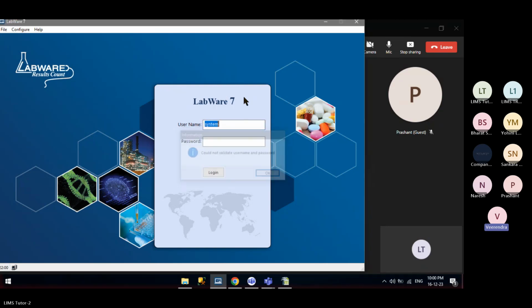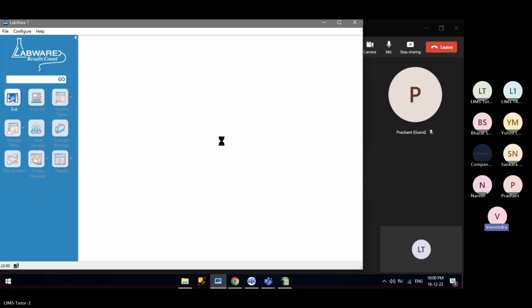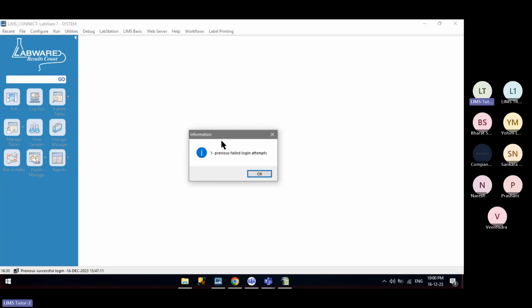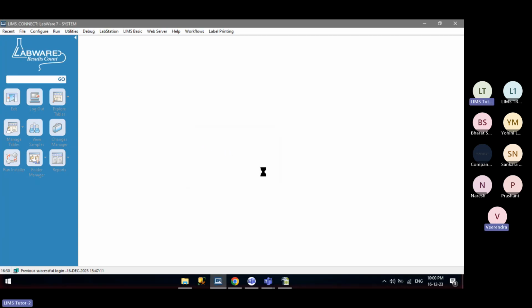I used V5 and did some testing and some gap assessment, and V8 also; we wrote scripts and executed them too. So you got an opportunity to work in LIMS 8 also? Yes, V8. We are still stuck in 7. Oh, okay.